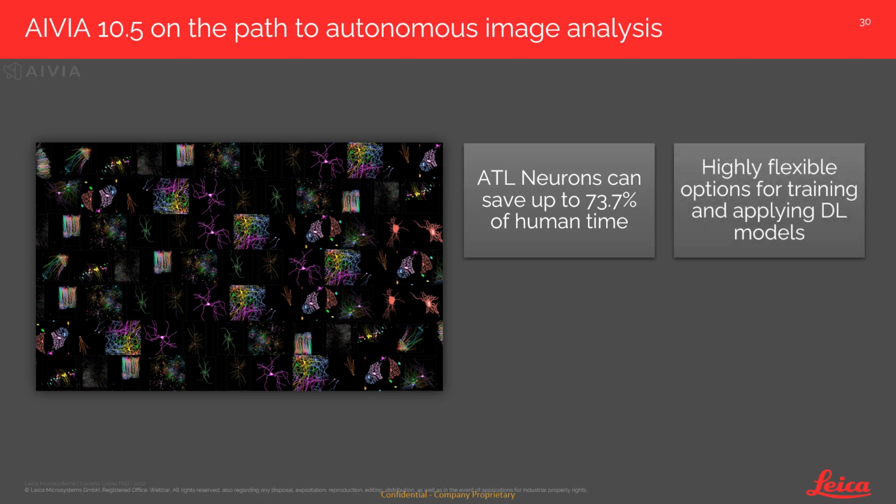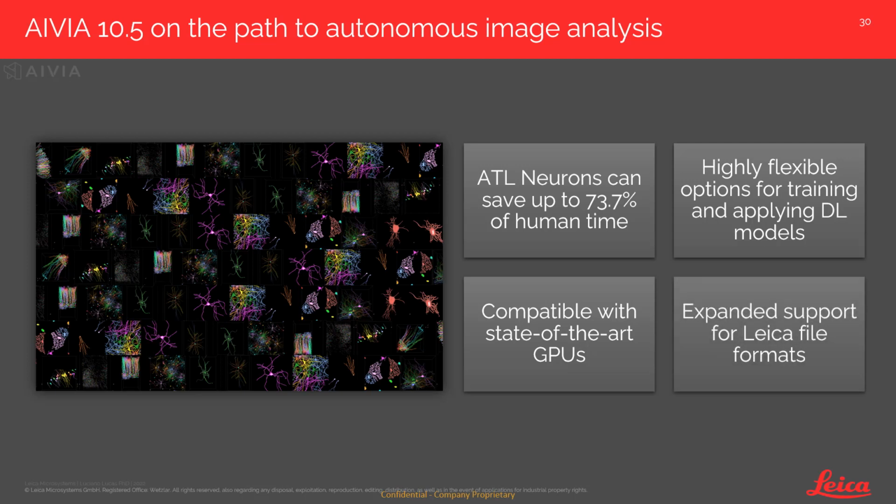We've added highly flexible options for training and applying deep learning models for the more advanced users among us and developers. And we've added support for the latest GPUs so you can do things even faster. Finally, we've added additional support for Leica file formats, specifically for the Falcon imaging modality.